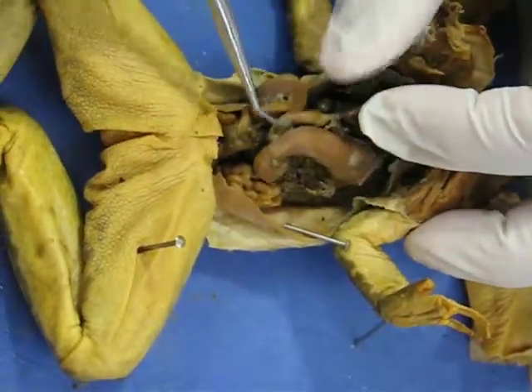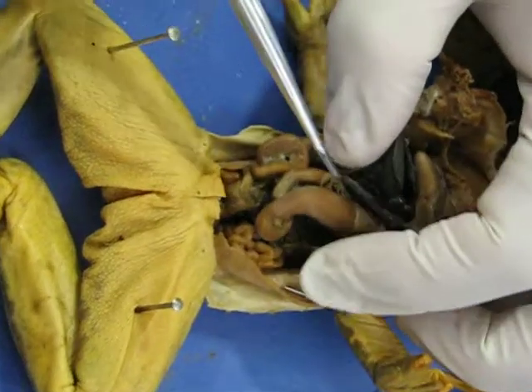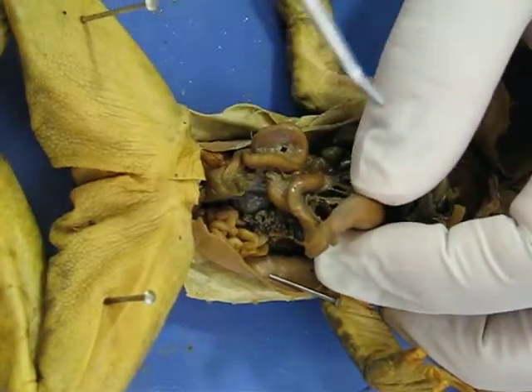Pull this all back. You see this big structure right here — that is the stomach, which then attaches to the intestines that wrap all around.